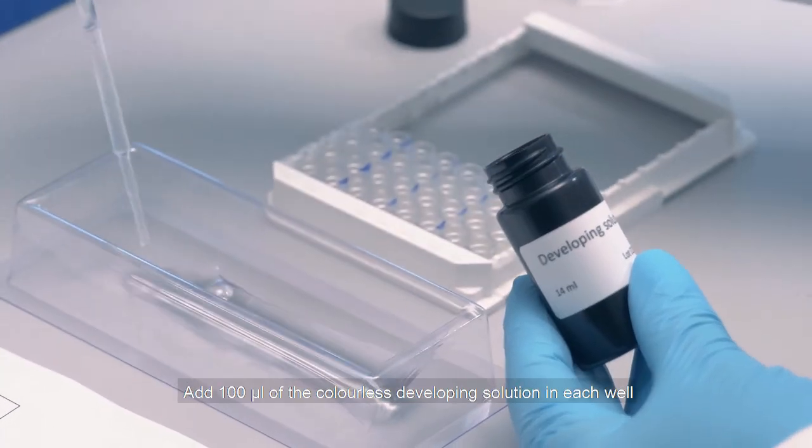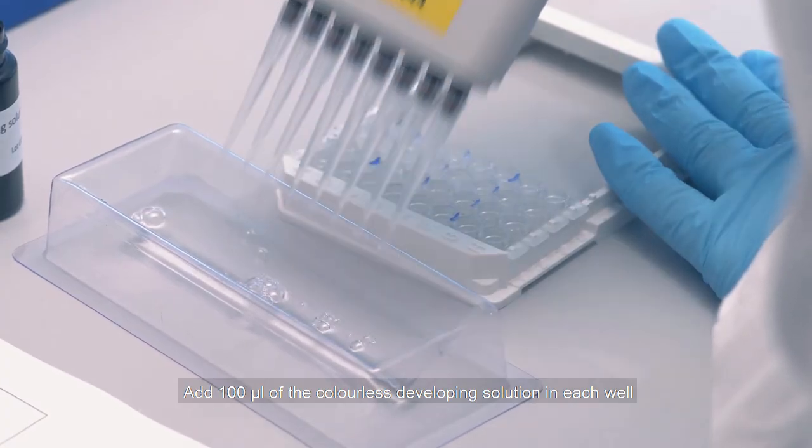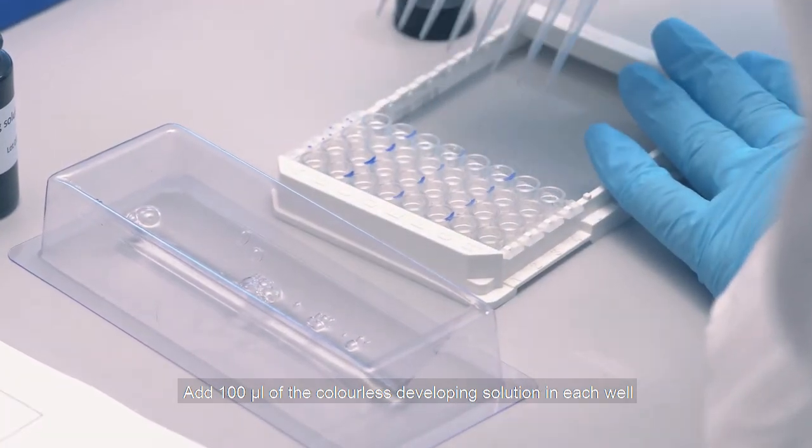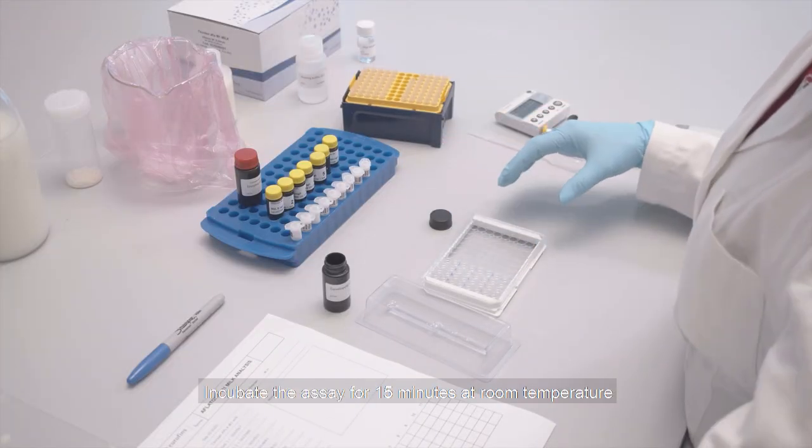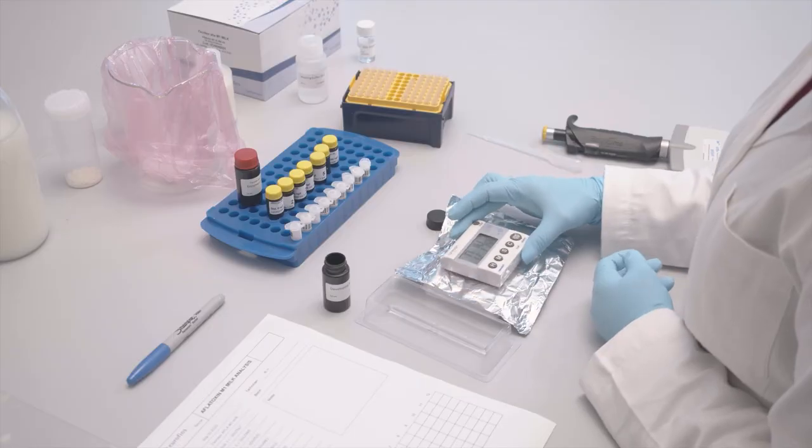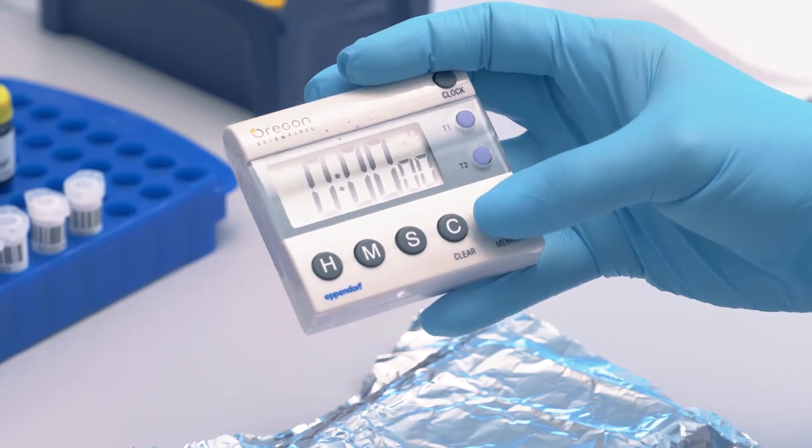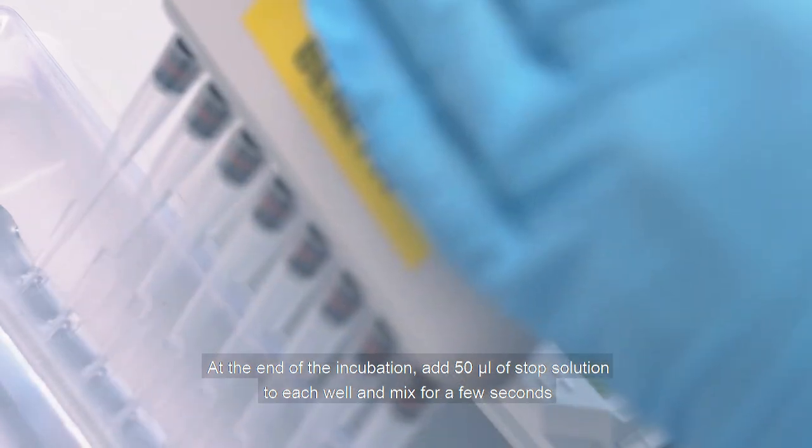Add 100 microliters of the colorless developing solution in each well. Incubate the assay for 15 minutes at room temperature. At the end of the incubation, add 50 microliters of stop solution to each well and mix for a few seconds.